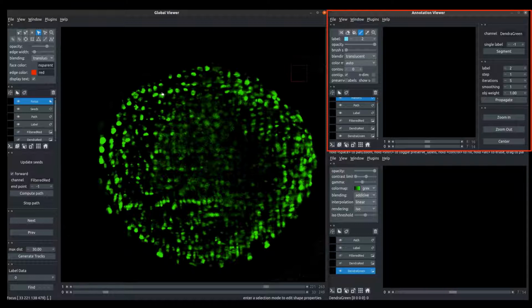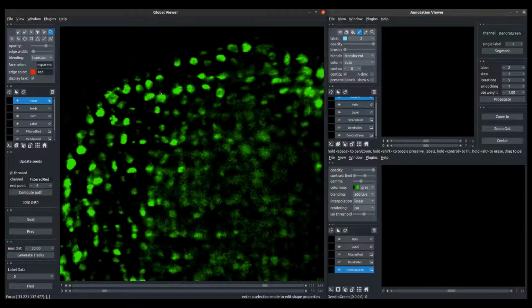On the bottom right corner, we have the volume view, where we have a volume or surface rendering to evaluate how our segmentation is doing across different Z stacks. Now I'm going to present a brief demo of how the annotation works.